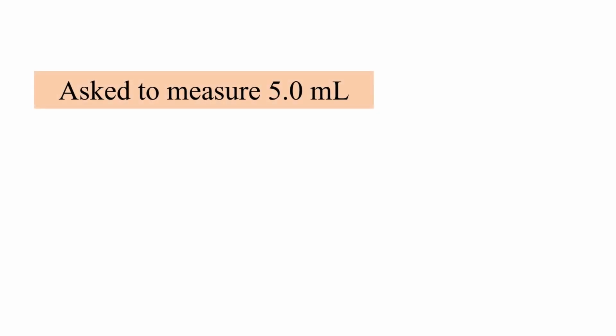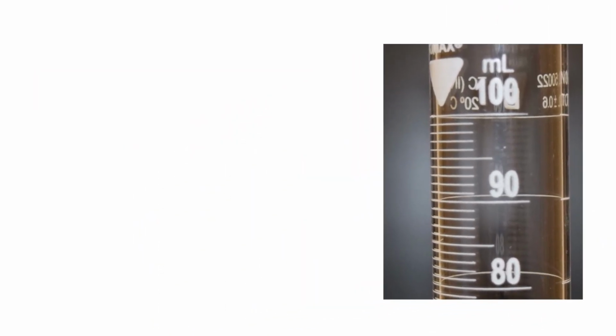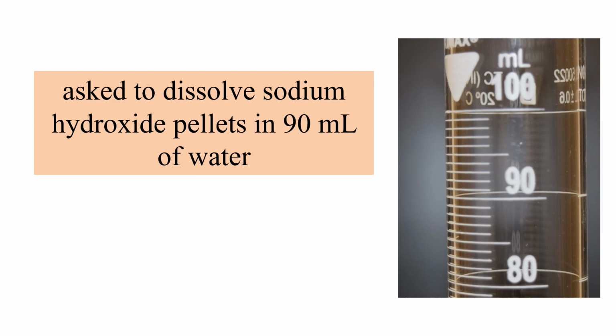For example, you are asked to measure 5.0 milliliters of acetic acid for a titration experiment. You would choose the 10 milliliter cylinder. If you choose the 50 or 100 milliliter cylinder, you will find that there is significant error introduced into the data because there is less precision. On the other hand, in the same titration experiment, you are asked to dissolve sodium hydroxide pellets in 90 milliliters of water. Here, you would choose the larger 100 milliliter cylinder.